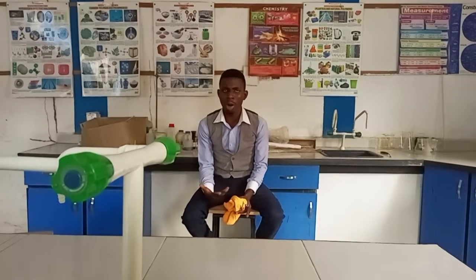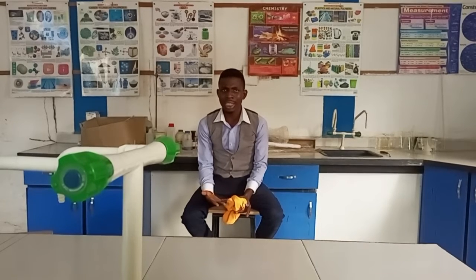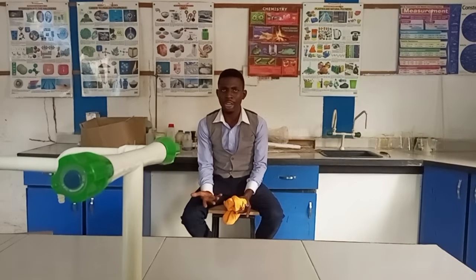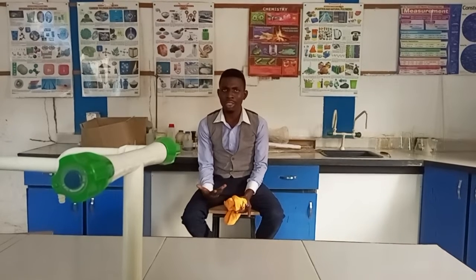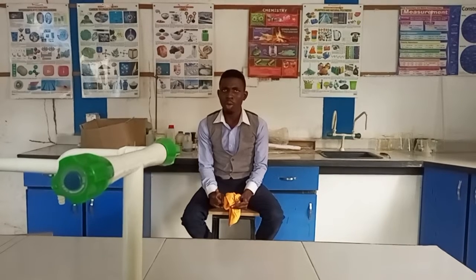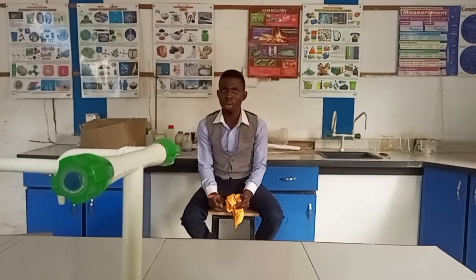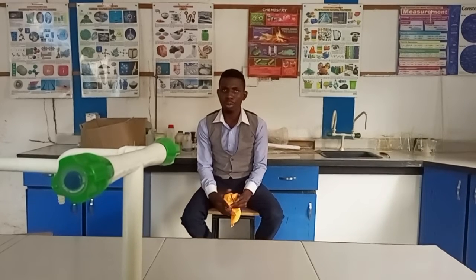As I proceed, I will give examples of strong acid, strong base, weak acid, and weak base, because it will be very helpful. Anytime you are doing your titration experiment, number one, look at the choice of acid, look at the choice of base. The choice of acid and the choice of base will determine the indicator that will be suitable.